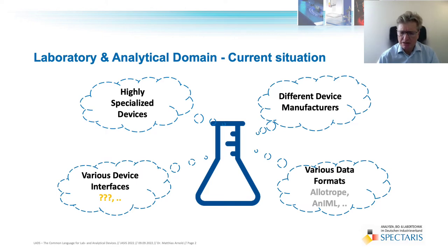The current situation is somewhat reminiscent of the dark ages in automation before the introduction of OPC. Different communication interfaces, if any at all. A lot of them still with serial interfaces talking vendor-specific protocols with very limited documentation. Modern devices might have USB connectors or even some Ethernet capabilities. However, when it comes to open, standardized protocols, you're 99% lost in no man's land.